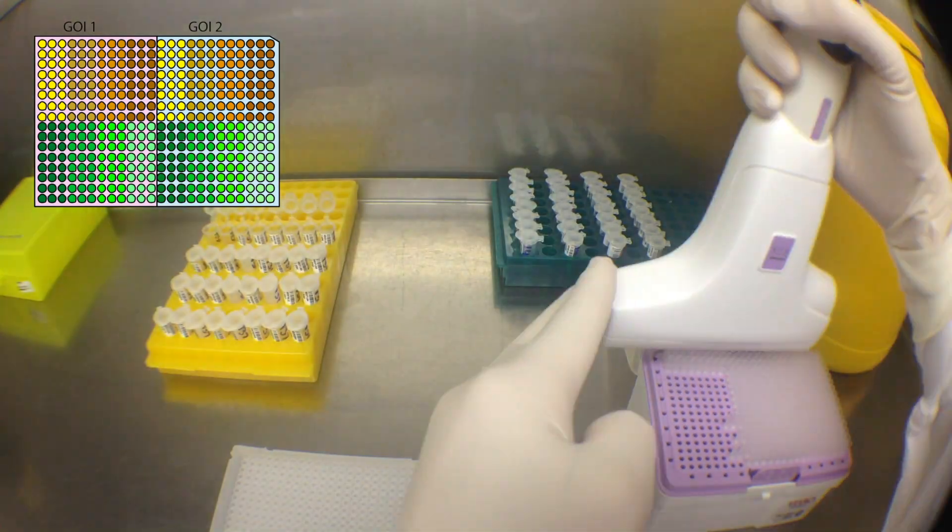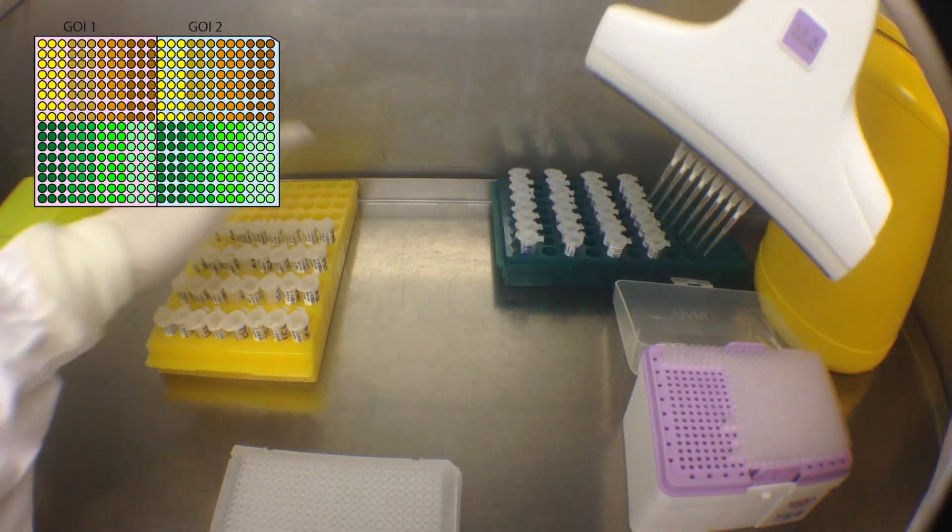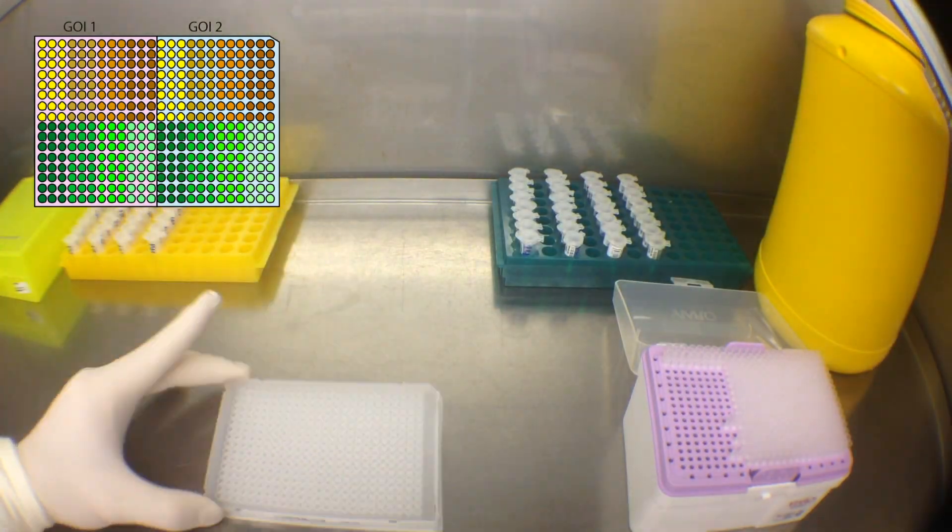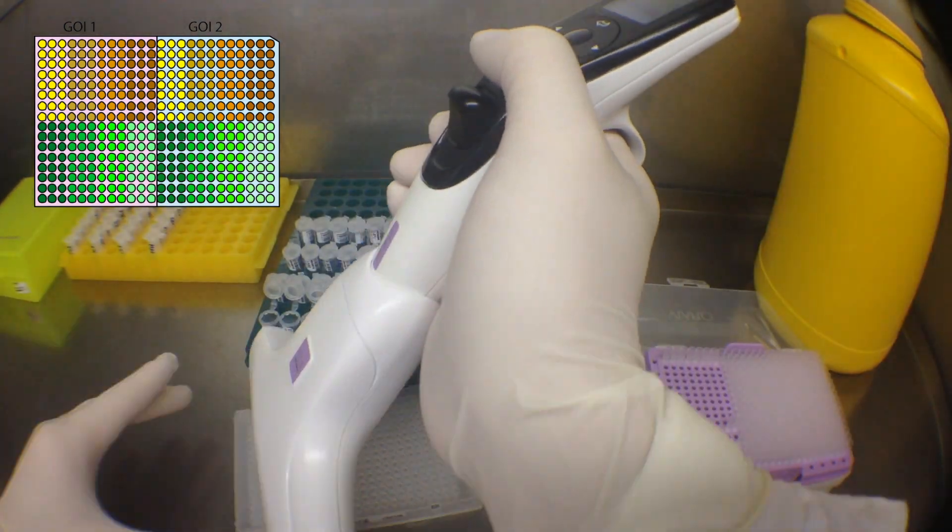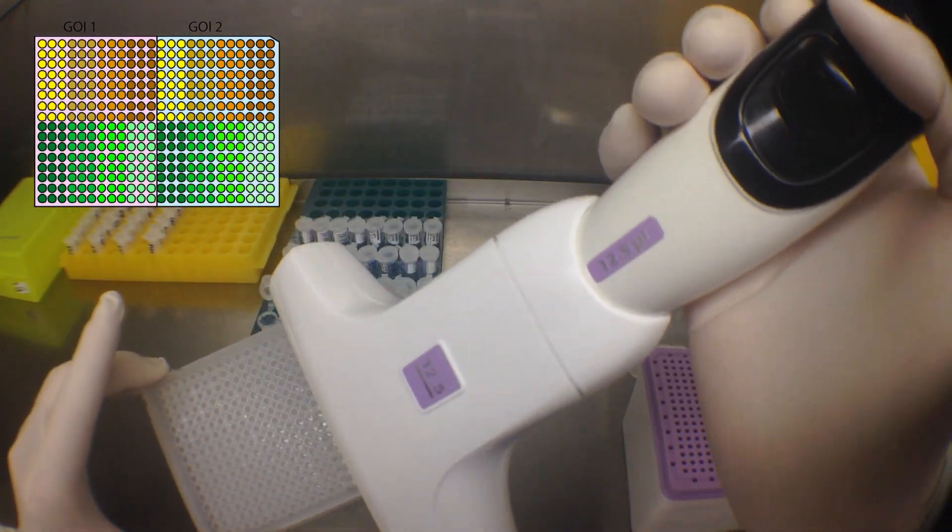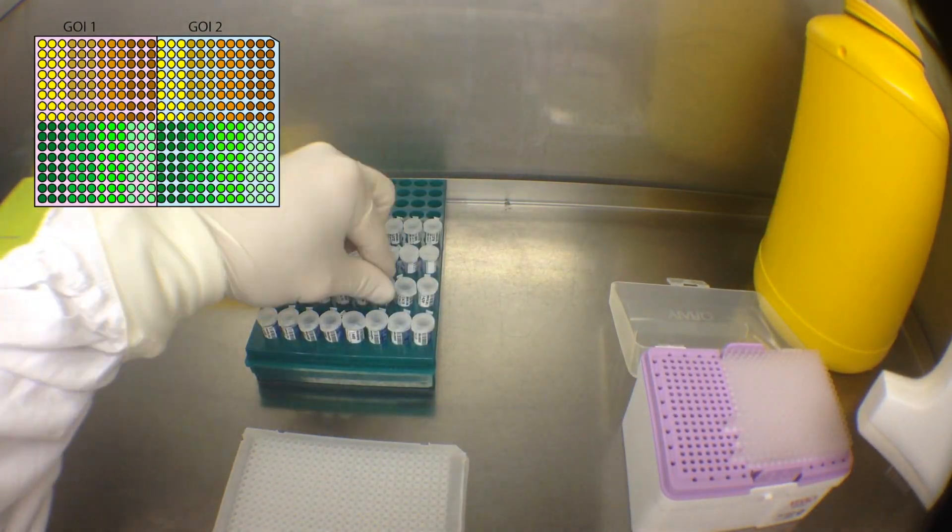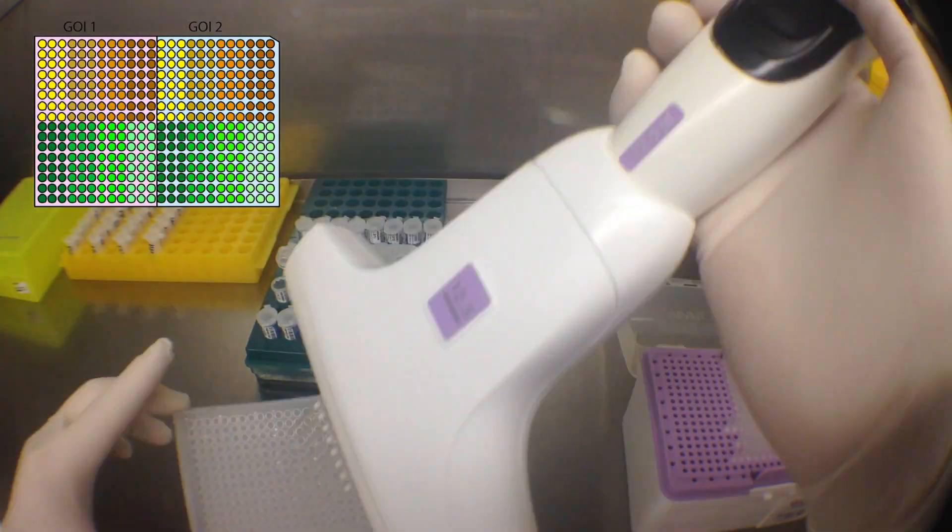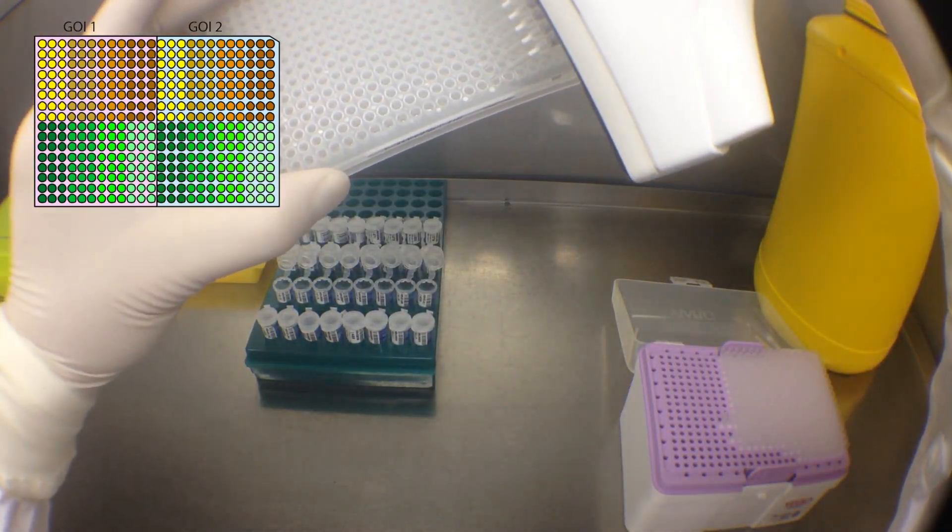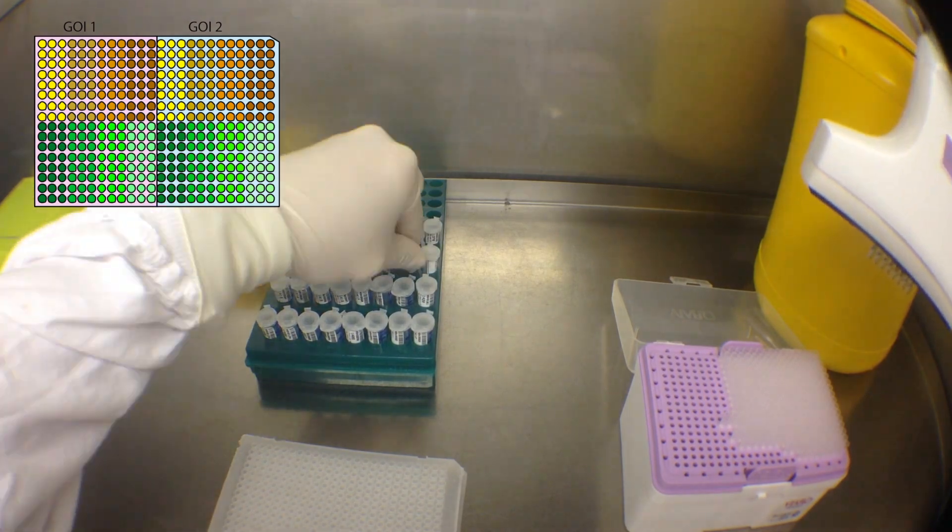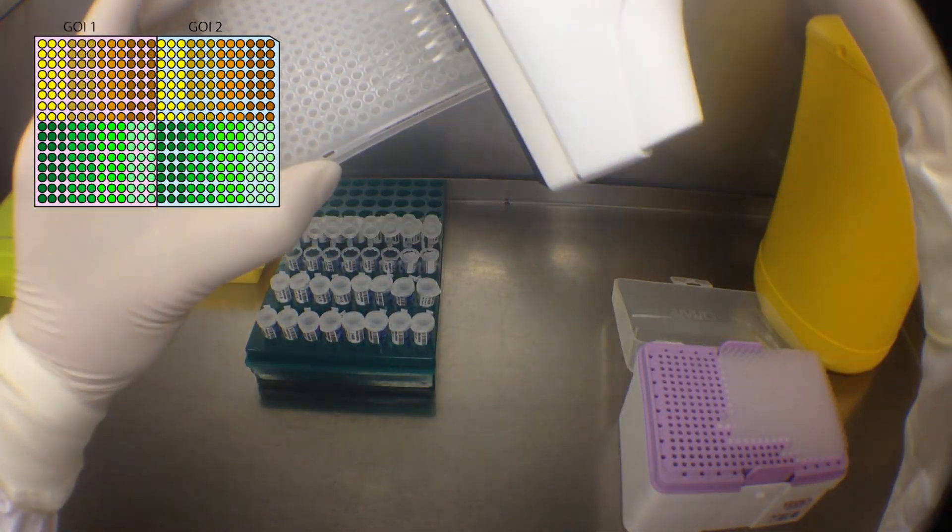Although you could use a liquid handling robot to do a lot of this pipetting for you, these robots are only good for routine processing. If I'm regularly changing the layouts of my plates or sample numbers, I find that I have greater control using these pipettes instead. In the same time needed to program the robot, I can prepare the 384-well plate by hand. This experiment has taken less than 10 minutes to set up.